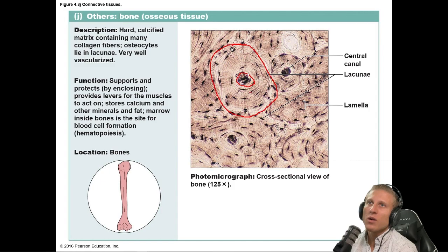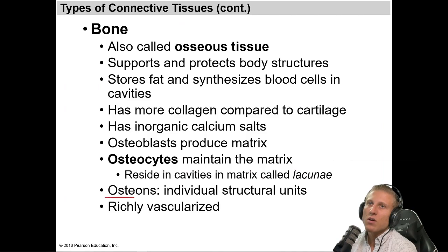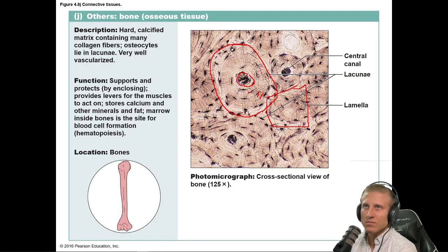And then here we have individual lacunae. The lamella is just kind of the space in between these osteons that isn't uniformly encompassed. But inside here, these are the lacunae where individual cells, osteoclasts or osteocytes, are residing. So we all know bones in general function. This is what they look like. We'll leave it at that for now.